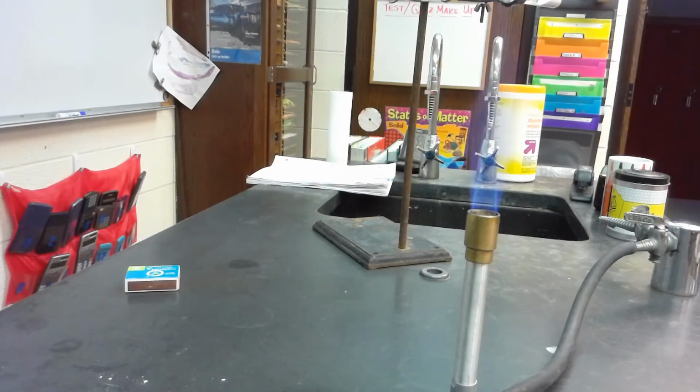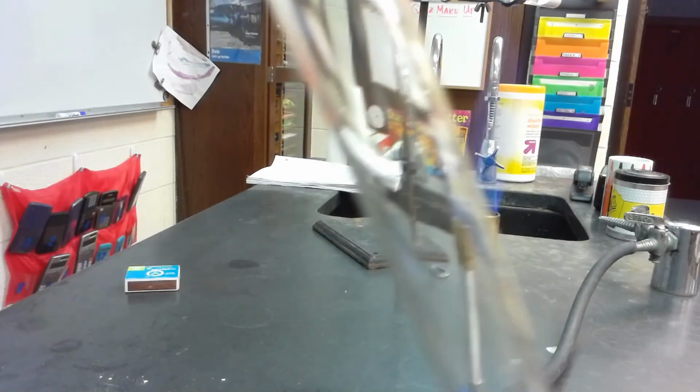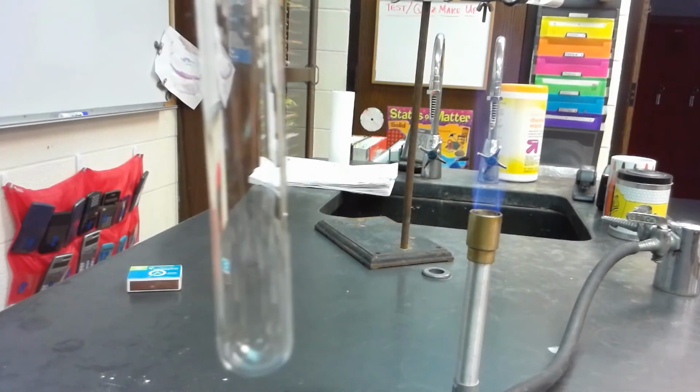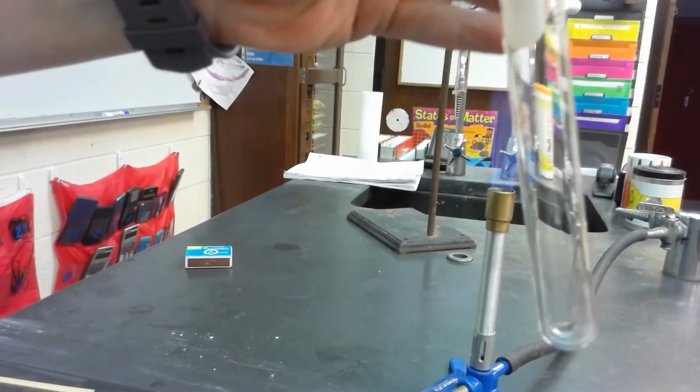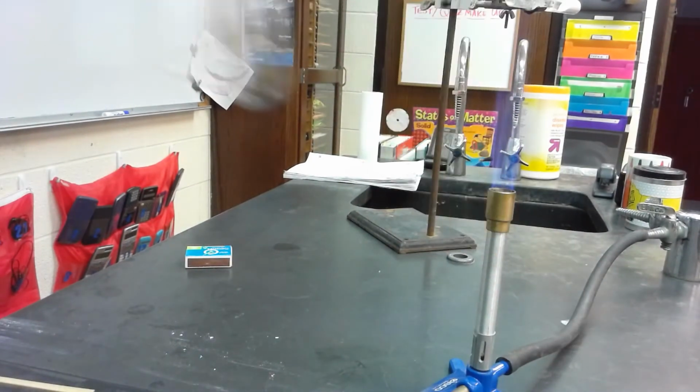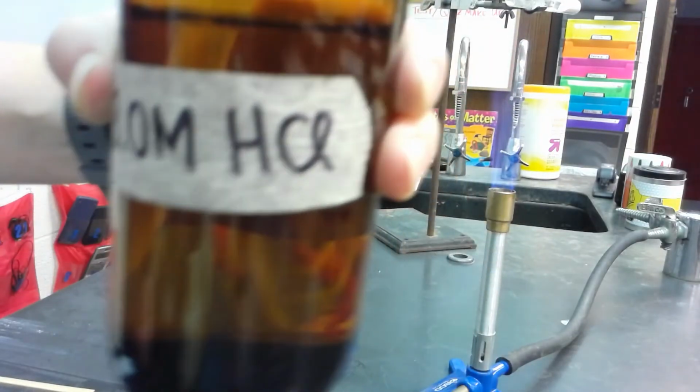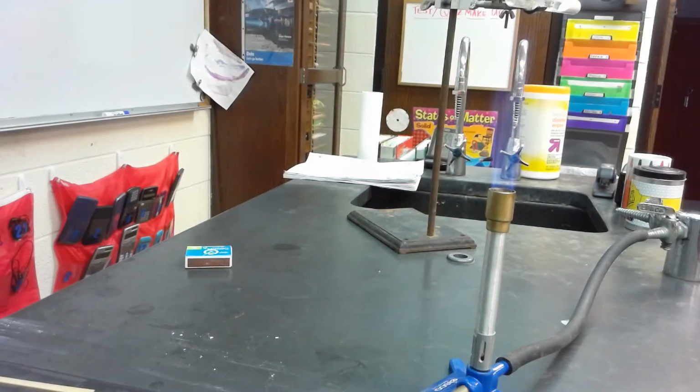So we have another large test tube. And I've got the burner going in the background for our splint test. Back the camera up just a little bit. There we go. So there's the test tube. We have hydrochloric acid here. And we're going to put a couple of squirts of that into the test tube. It says about 2 milliliters. We're not going to worry about measuring it today. We just need to have enough to get a good reaction.